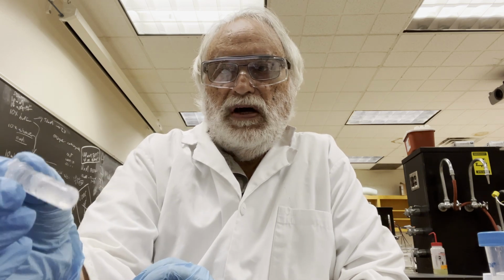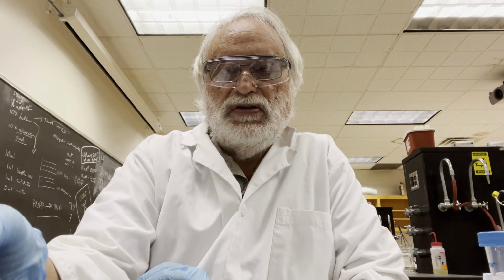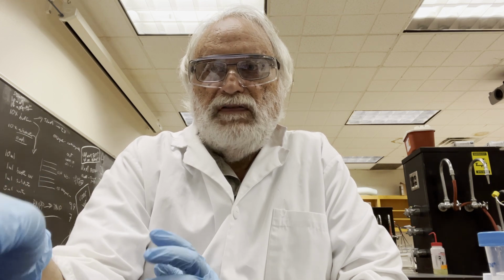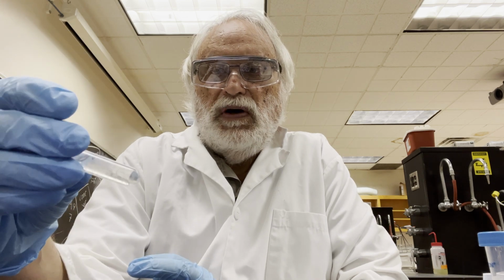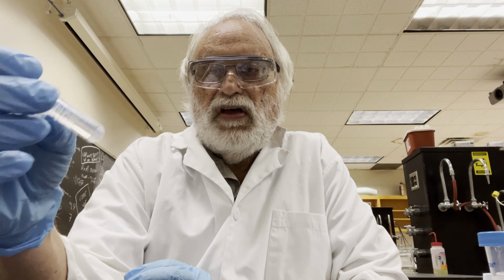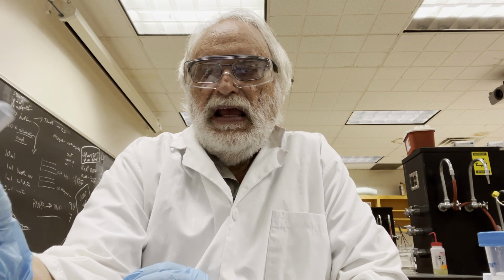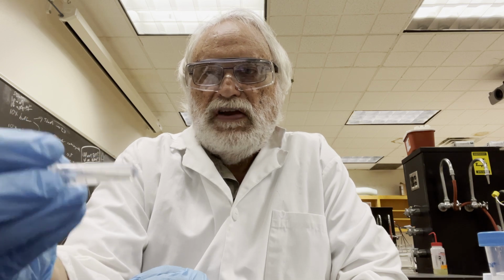I'll be using the same one twice, because remember, I just did the wild type. I didn't do a mutant. So I'll treat this wild type enzyme as a mutant as well. You will have 2 enzyme solutions. The reason I chose this one, the 0.3 molar first fraction, is that of all the column fractions, it had the most activity. It turned yellow the fastest, and in about a 20-minute assay I was able to get a significant amount of yellow, so I figured this would be the best one to use.